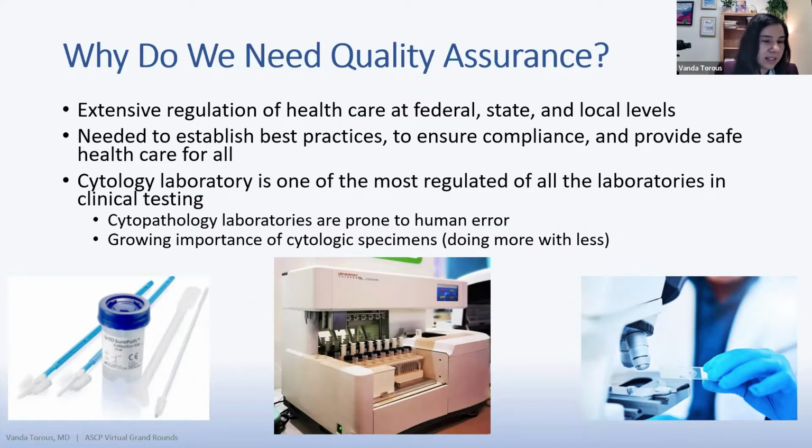Now, the cytology laboratory is one of the most regulated of all the laboratories in clinical testing. And why is this? Well, cytopathology laboratories are prone to human error. If you think about how heavily manual the workflow really is in cytology, for instance, think about how many hands cytology specimens pass through from specimen collection to processing to when the slide actually hits your scope.